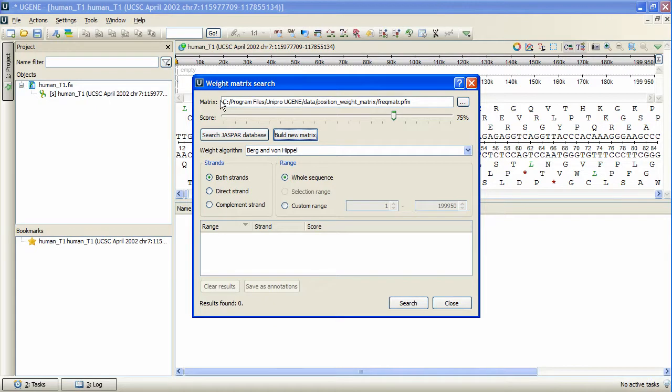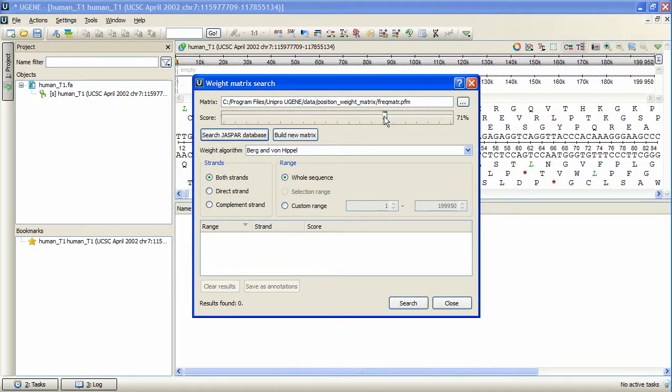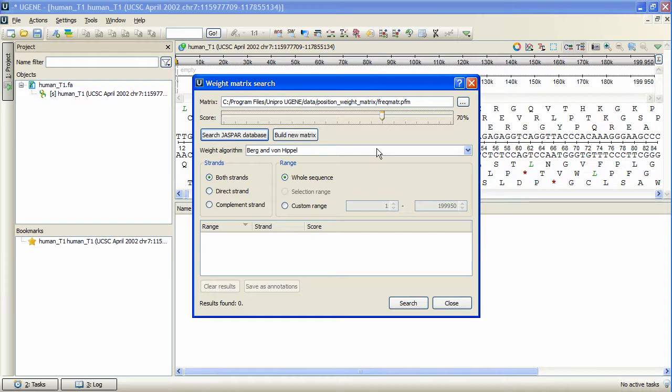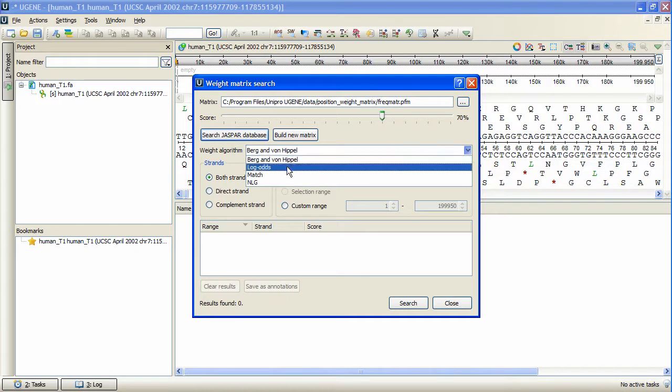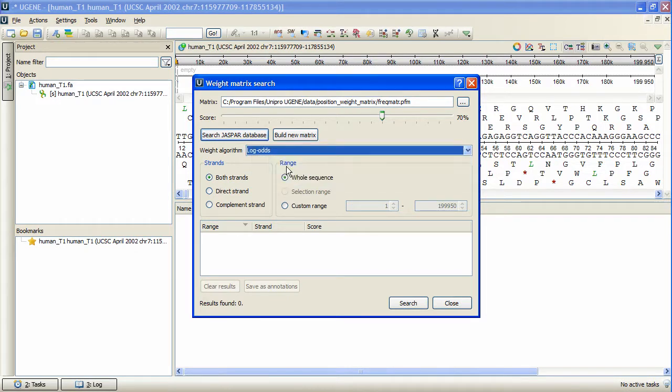Now we can adjust the identity score, which stands for the statistical significance of the search. Also, the weight algorithm must be set in order to transform the created frequency matrix into the weight matrix. Let's select the log odds algorithm. We will search in both strands of the whole sequence.